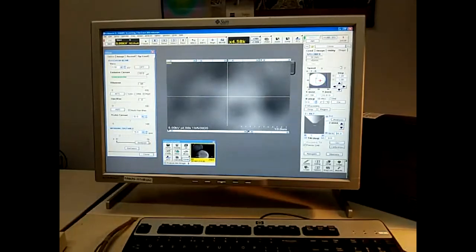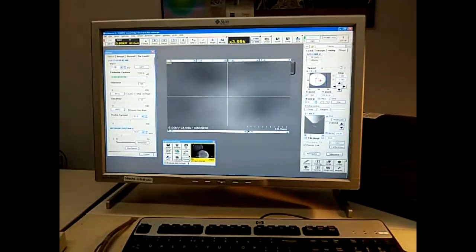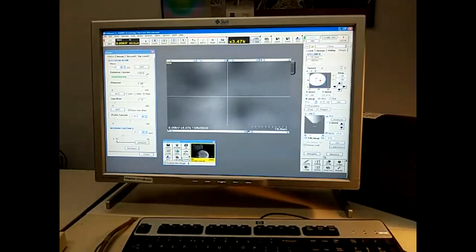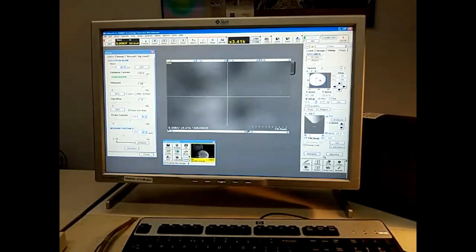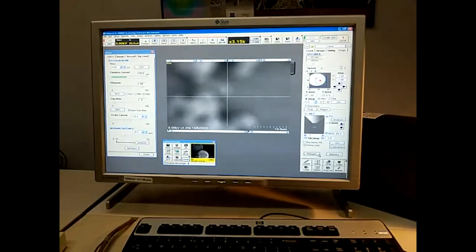I have it set right now to focus length. So the working distance, as you can see, is changing alongside the stage height. It won't be perfect when we get there, but it will be close.